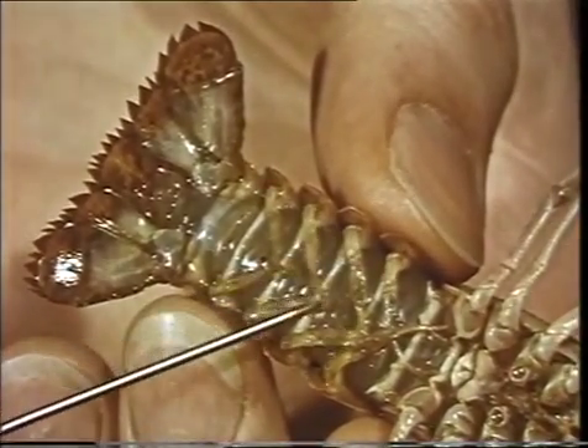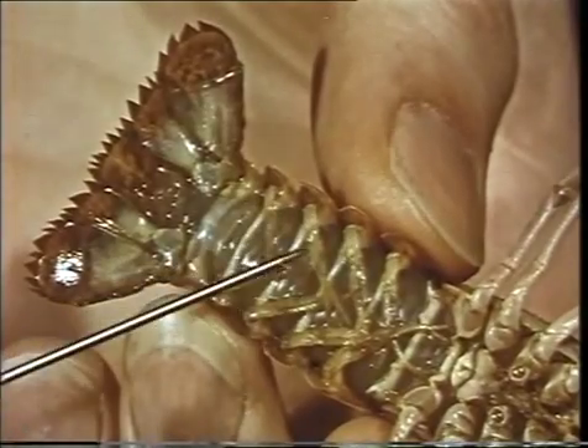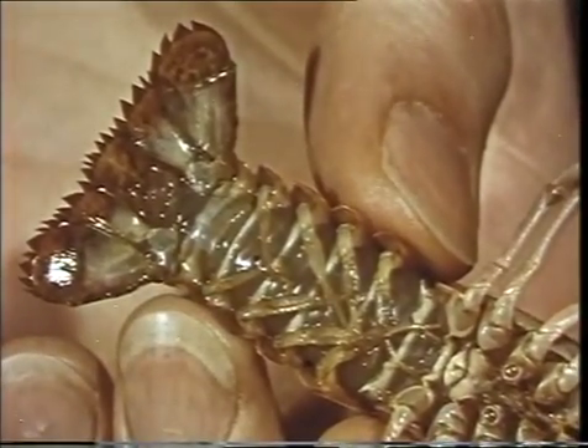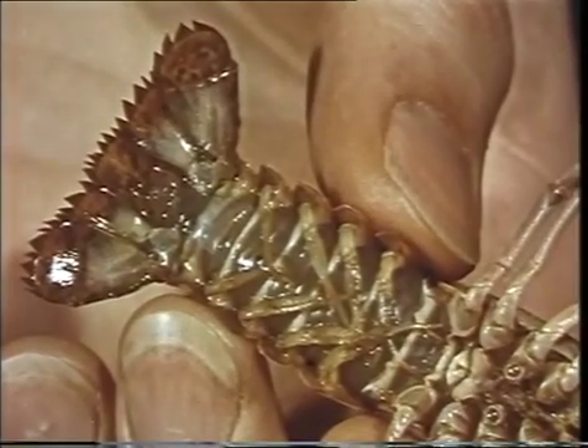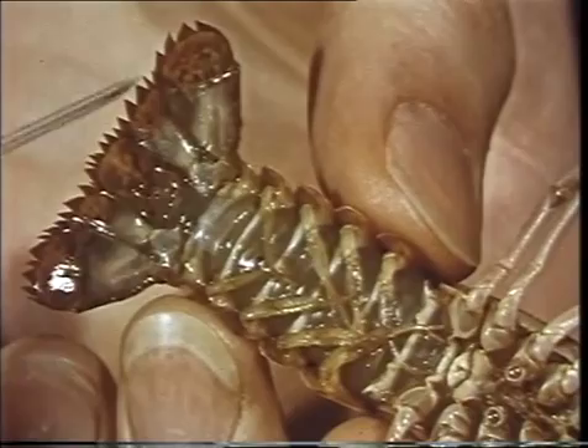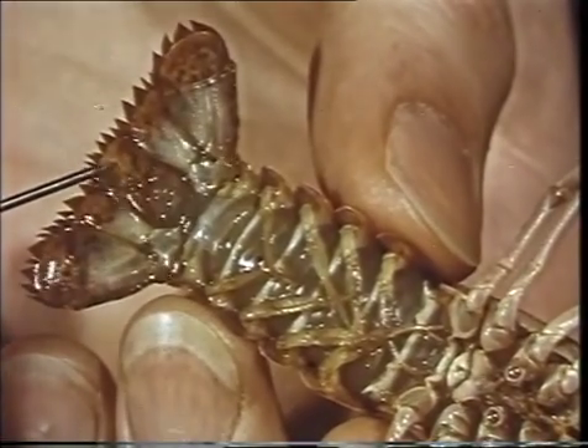The swimmerettes are appendages of the abdomen. One of their functions is to carry the female's eggs. The last pair of abdominal appendages is greatly expanded to form the broad uropods. These, together with the telson, form a broad paddle, which is used in swimming backwards rapidly.